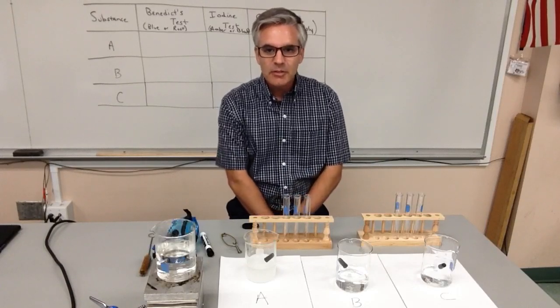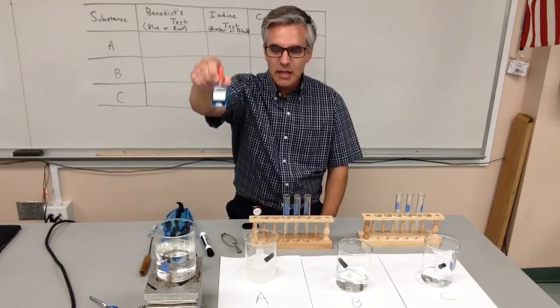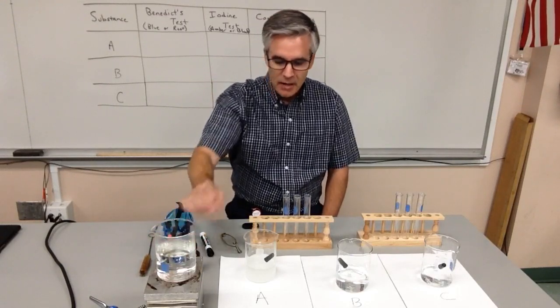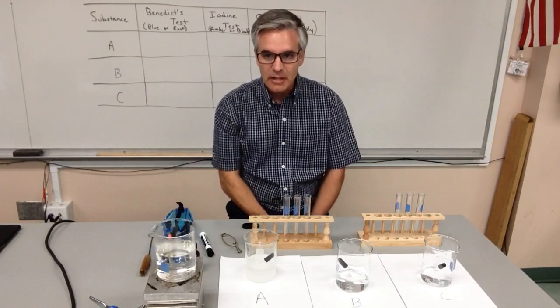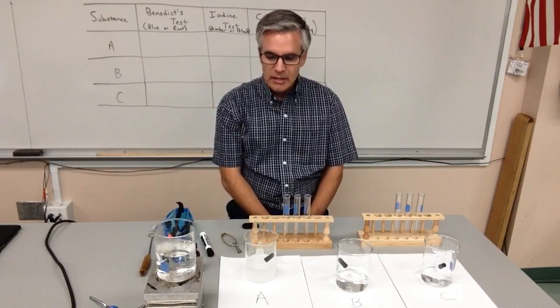As you remember from the notes, monosaccharides will test positive in the presence of Benedict's solution, and polysaccharides will test positive in the presence of iodine solution. We don't have a test for disaccharides, so we're going to use the process of elimination for that one. We're going to use our knowledge of those things to try to figure out which substance is which here. And again, that's our purpose.